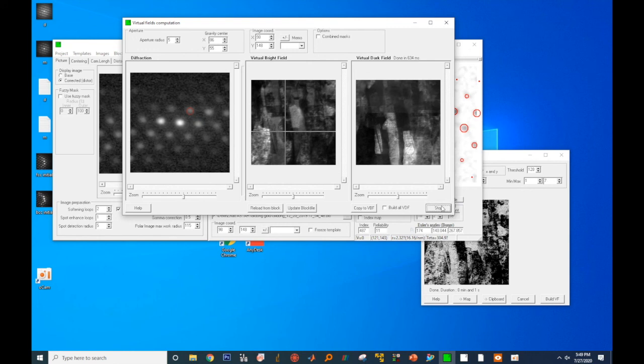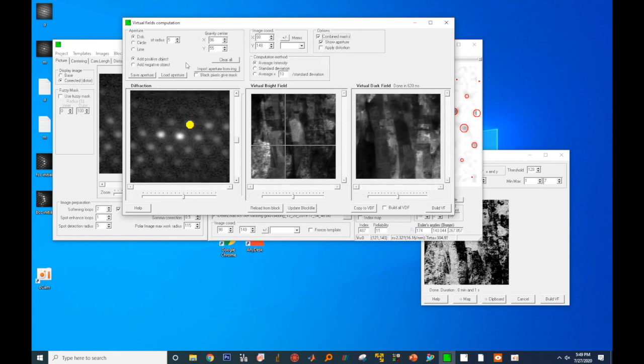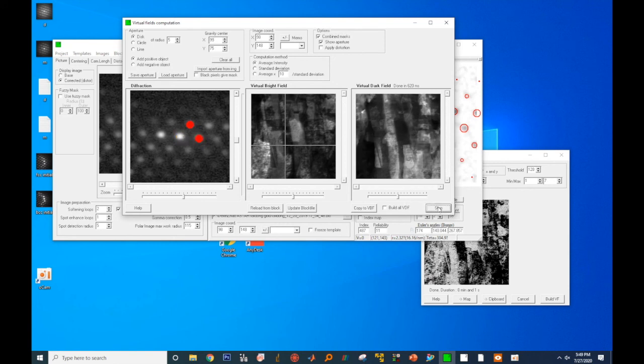You have seen a few examples. In addition, you can click on combined masks to create two apertures, and select multiple diffraction spots to form the virtual dark field image.